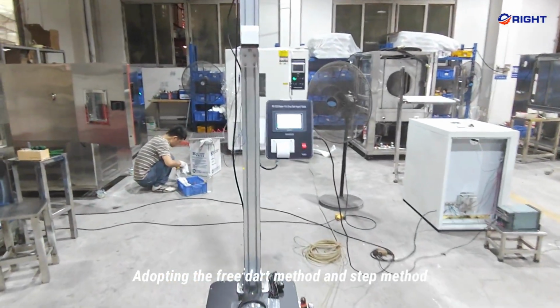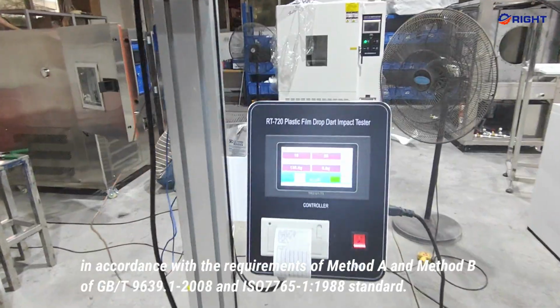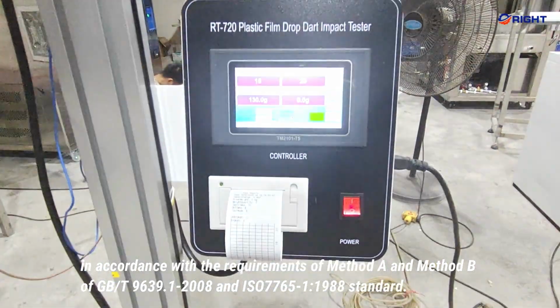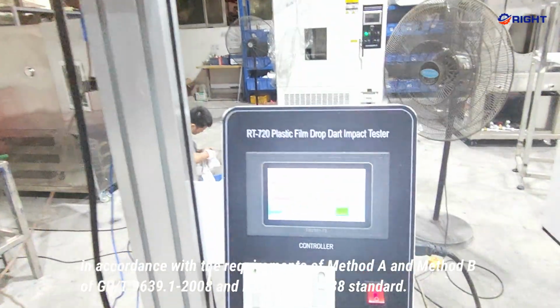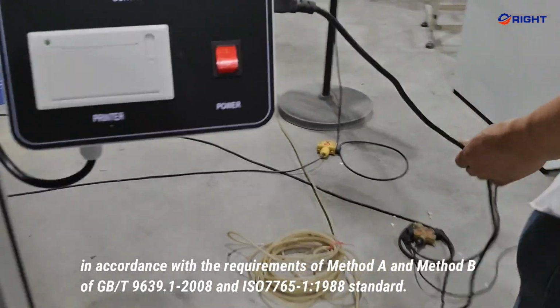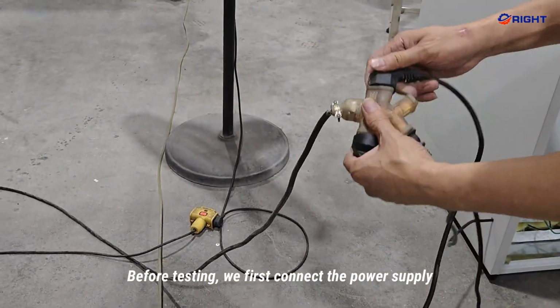Adopting the free dart method and step method, in accordance with the requirements of Method A and Method B of GB/T 9639.1-2008 and ISO 7765-1:1988 standard. Before testing, we first connect the power supply.